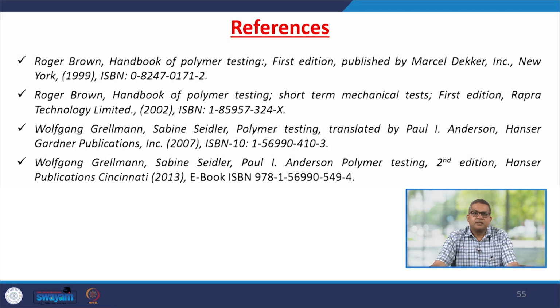So, dear friends, in this particular segment, we have discussed the mechanical properties and the testing protocol. And we discussed the Izod test and the Charpy test and drop test for the characterization of the polymeric samples. And for your convenience, we have enlisted a couple of references which you can utilize as per the requirement.